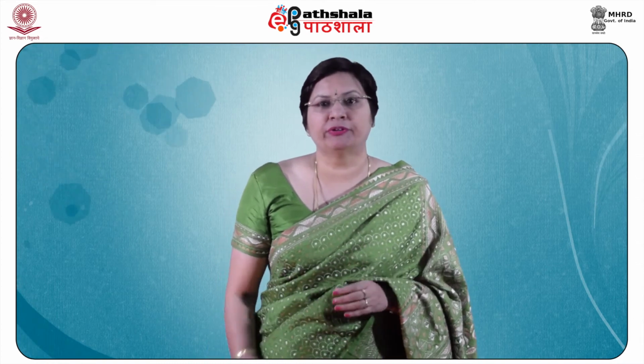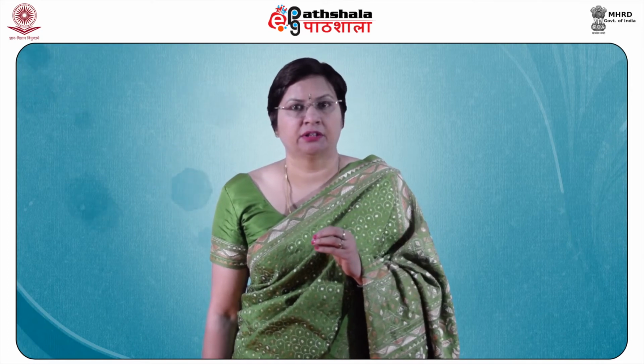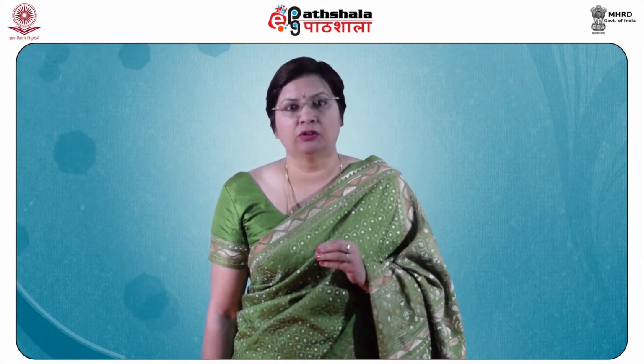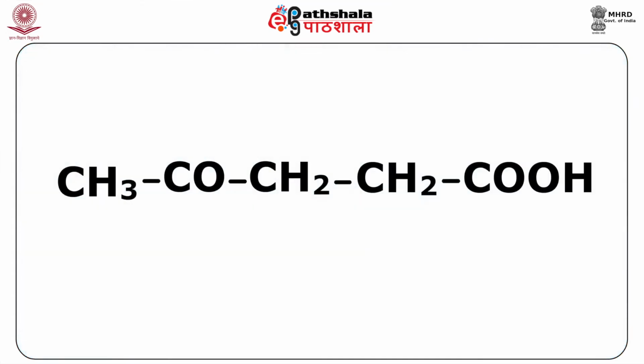The appearance of a 3 proton singlet at 7.88 tau must be a methyl group attached to a carbonyl group. Hence, compiling all this information, the compound under investigation is CH3CO, CH2, CH2, COOH. You can see here there is a carbonyl group, a COOH group as we have derived, and there is a CH3 and 2 methylene groups.